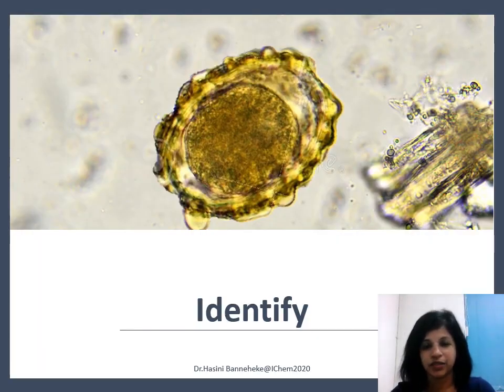So this is another structure that may be found in fecal samples. This is quite straightforward and easy, and this is quite common in Sri Lanka as well. Just see whether you can recognize what this structure is.